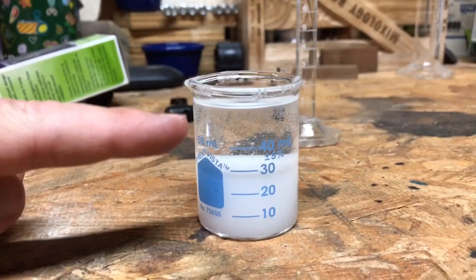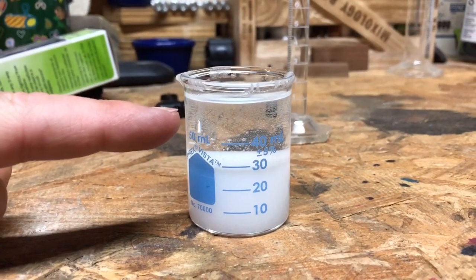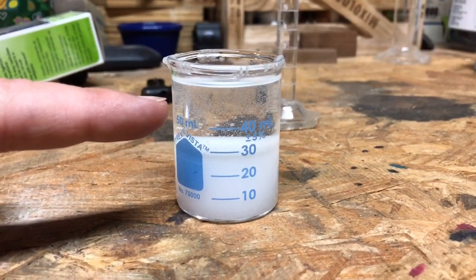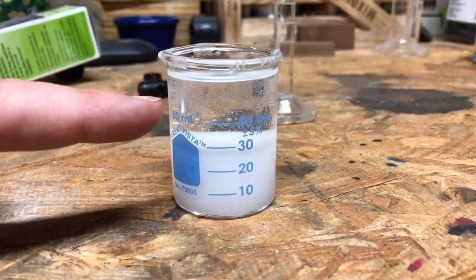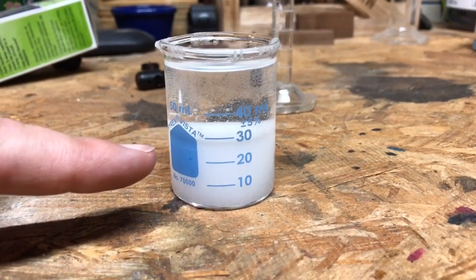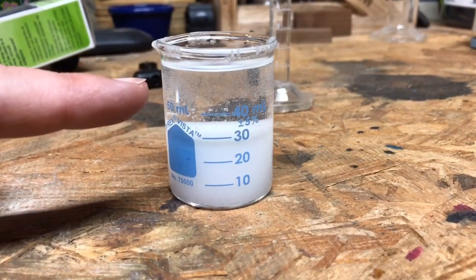And so what we see is this area up here is completely saturated. None of this water can hold any more dissolved ions, so all of the crystals sink to the bottom. So what we want to study is not this, right? We want to study this part right here.